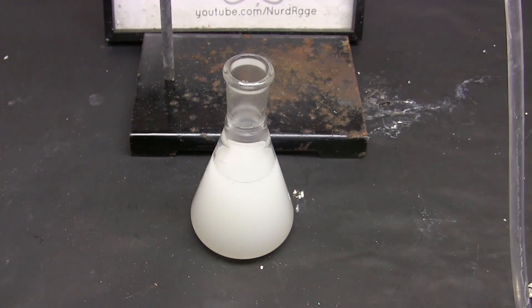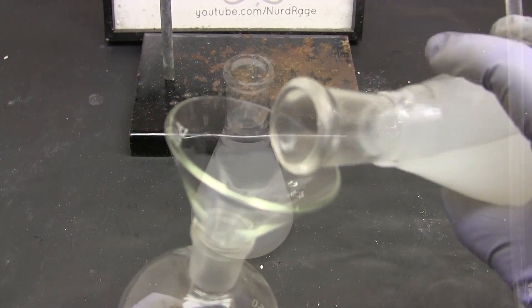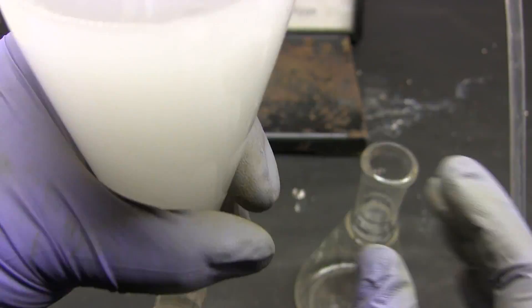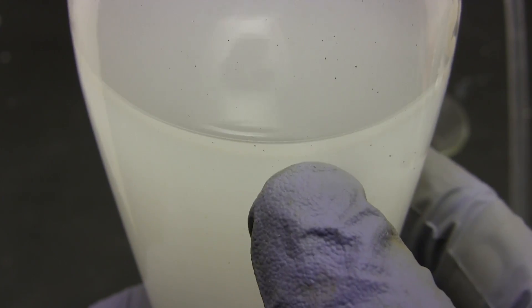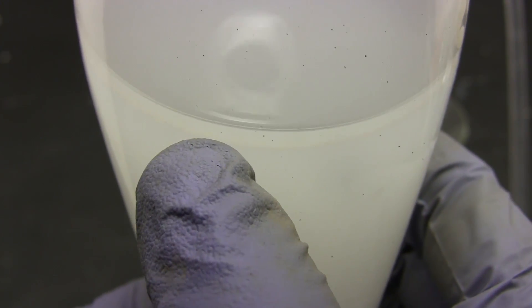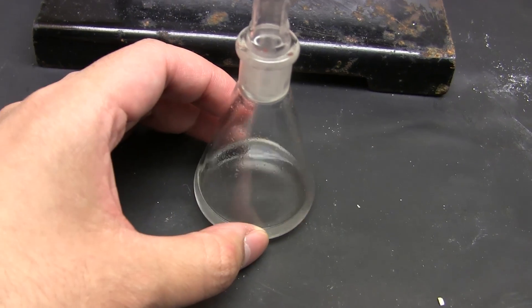So it floats on the aqueous layer like an oil. We can then use the separatory funnel to separate just the ethylpropionate layer. It's hard to see on camera but the layer is there. And here it is, our sample of ethylpropionate.